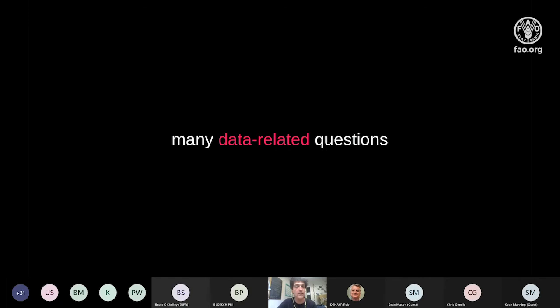The other thing we found is that we grew these activities as research experiments. Very recently, in the last 2 years, there are a lot of data-related questions. We're comfortable now with what we can predict and the statistical tools we need to use. The difficult stuff was answering questions such as: what are the soils that we need to scan from our archive? How many soils do we have that have a carbon value and MIR spectra and that are in the top 5 centimeters, for example?